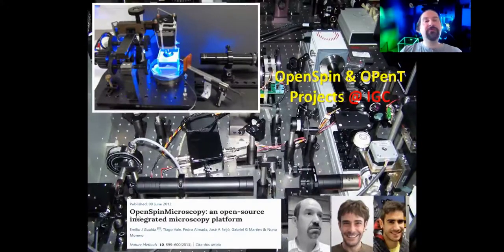So we joked and came up with a different name, OpenSPIN microscopy, instead of OpenSPIM microscopy, as that one is fairly well known and fairly well documented on the internet. The term spin here refers to the fact that we're focusing on the high precision rotation of samples that you could do with this, in this representation a fairly simple setup, which actually allowed you to do optical tomography.